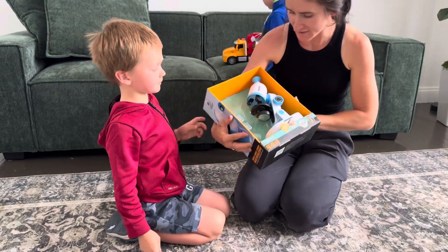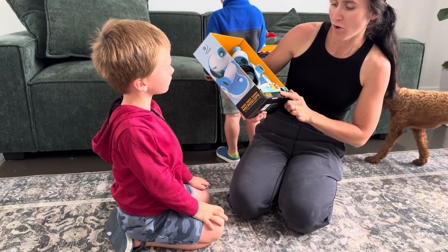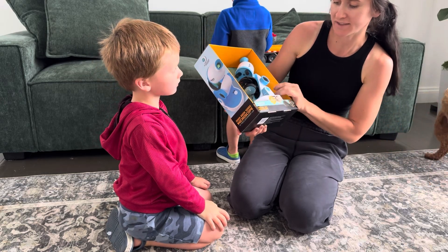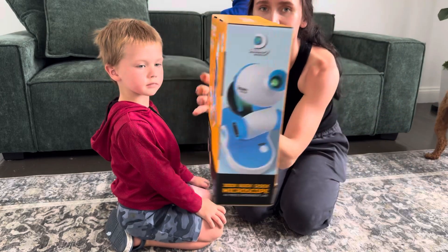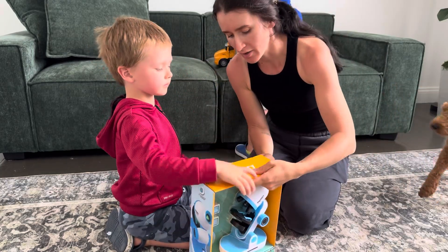Hello guys, we've got something exciting for you! We have received this Discovery microscope — it is a 41-piece experiment lab right here. It has all these amazing accessories included. Let's open it up!